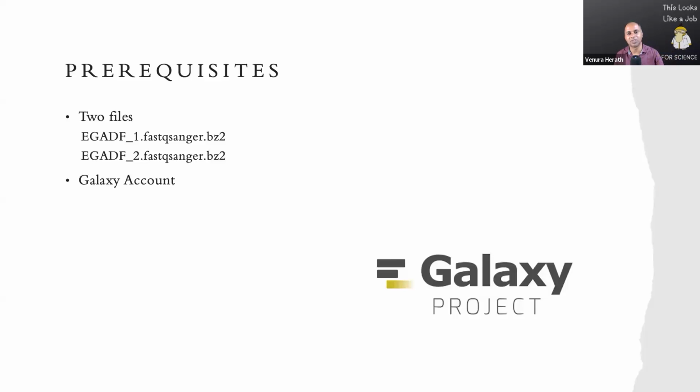It will be like a jumble. You need to download the file and then open it. So I decided to go with galaxy.eu, so that hopefully the ride will be smooth.